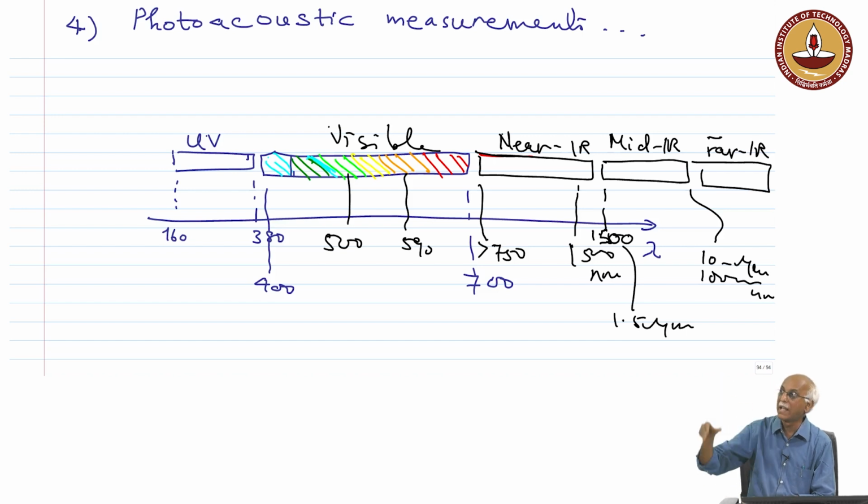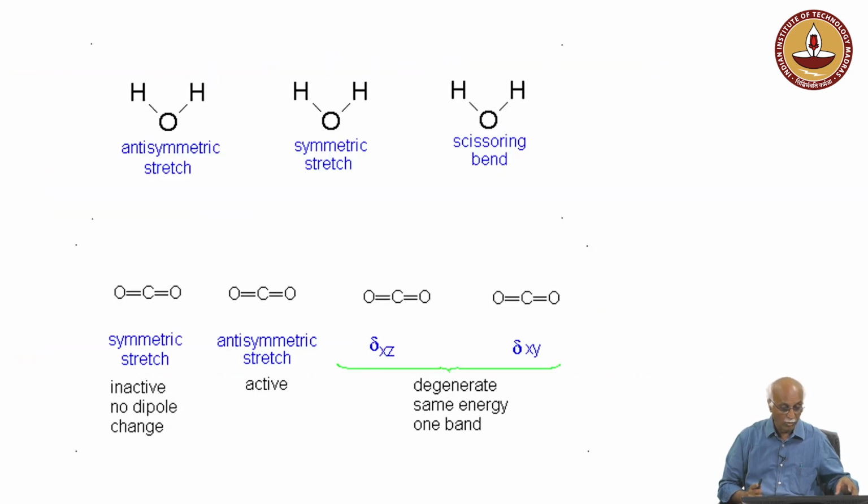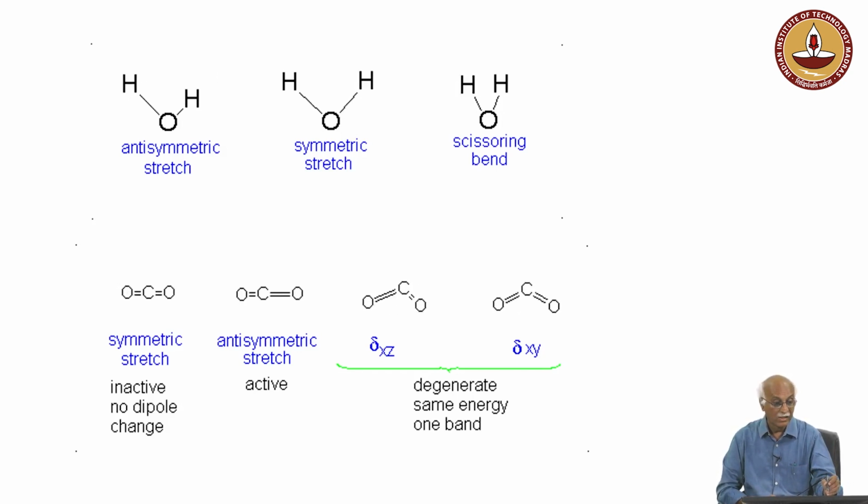So, what we see is the transmission. Through a glass window the light gets transmitted because internally in the glass the light is interacting with molecules and atoms, and in turn the electromagnetic wave is generated again, through energy transfer to the polarization wave. But when absorption comes into the picture, the electron jumps to the upper energy level.